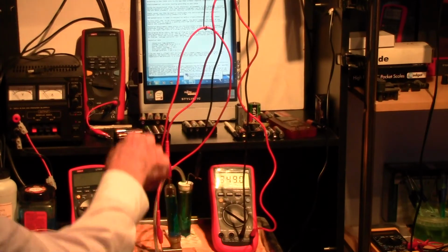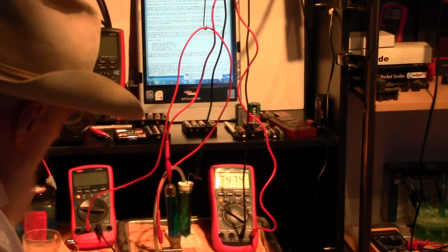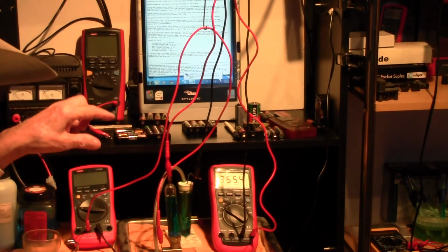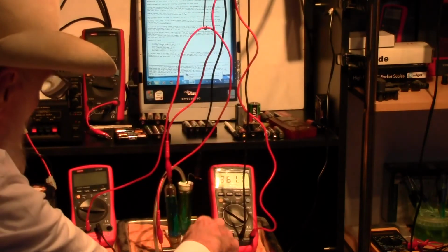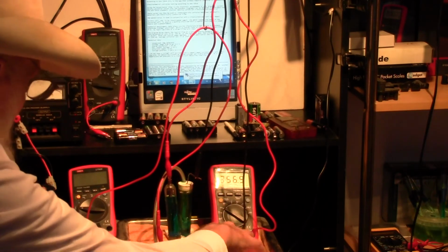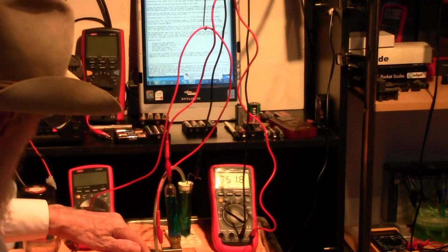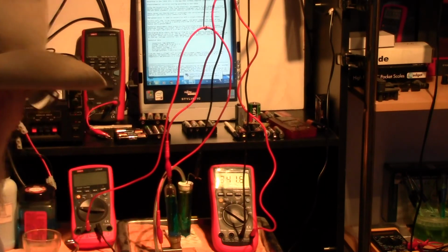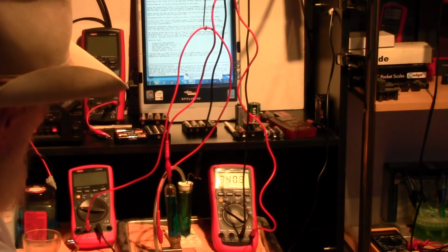So this is a replica of DIN 50918. But you will notice that this is in closed circuit condition. In other words, the charges go round the measuring circuit. This is insulating material, so they don't go into this cloth, and they come through the Luggin capillary to the measuring anode, the working electrode, and so this is exactly as it's specified to be set up by DIN 50918.